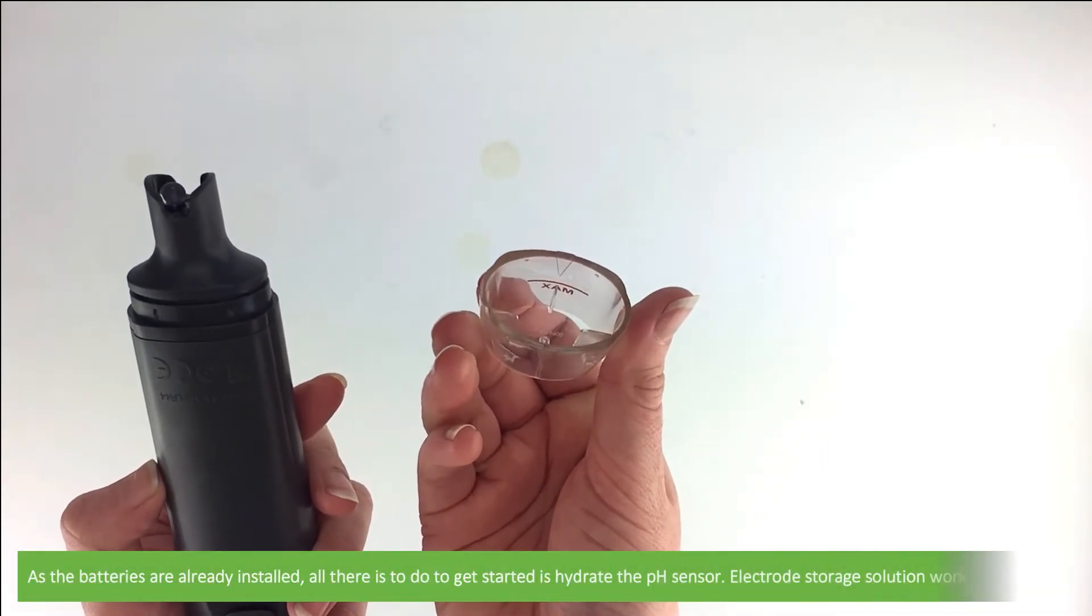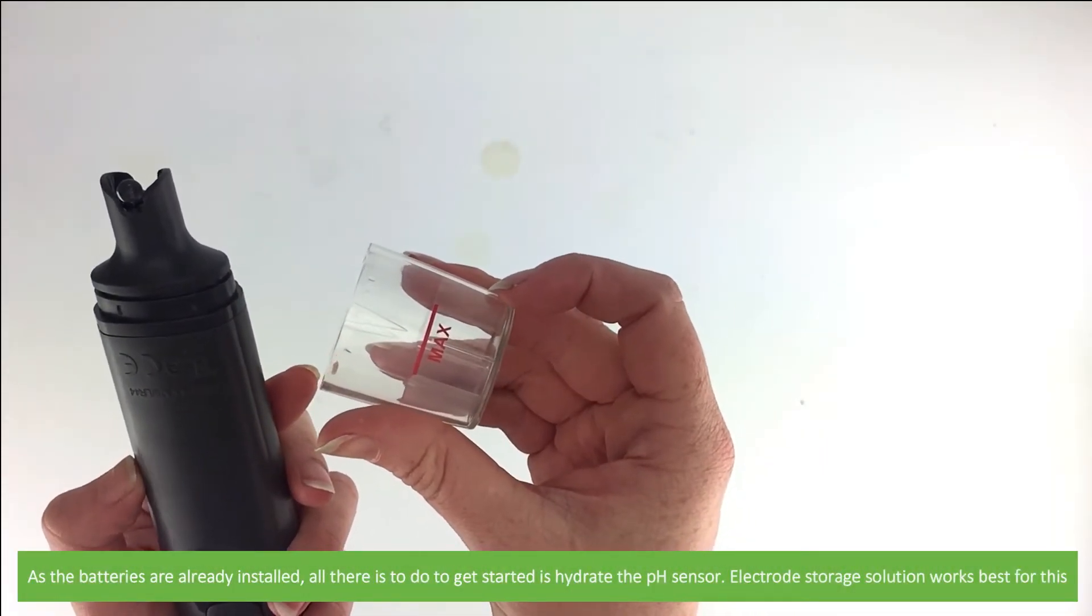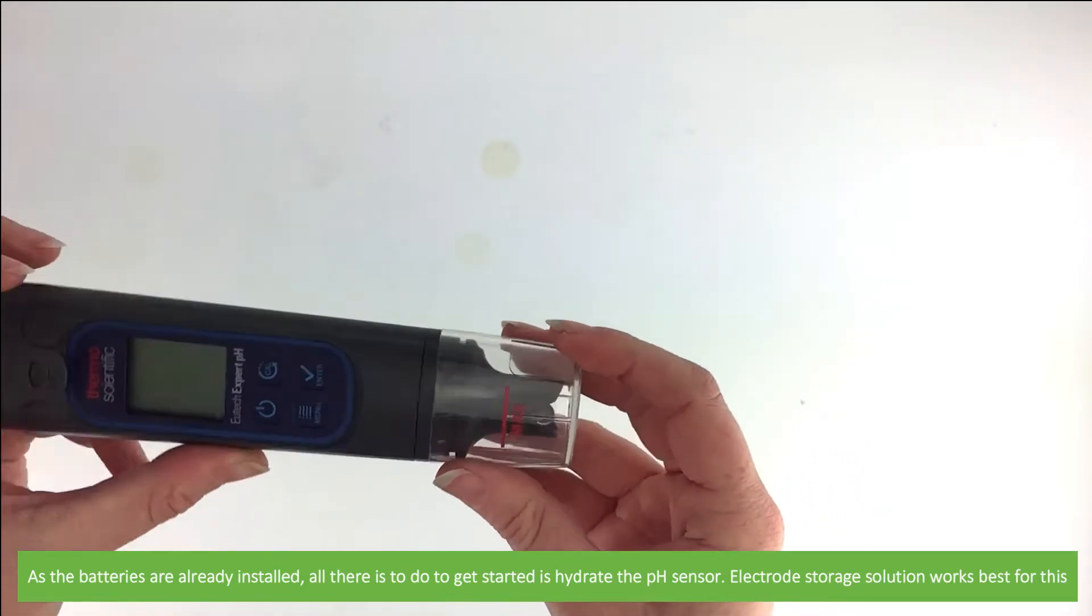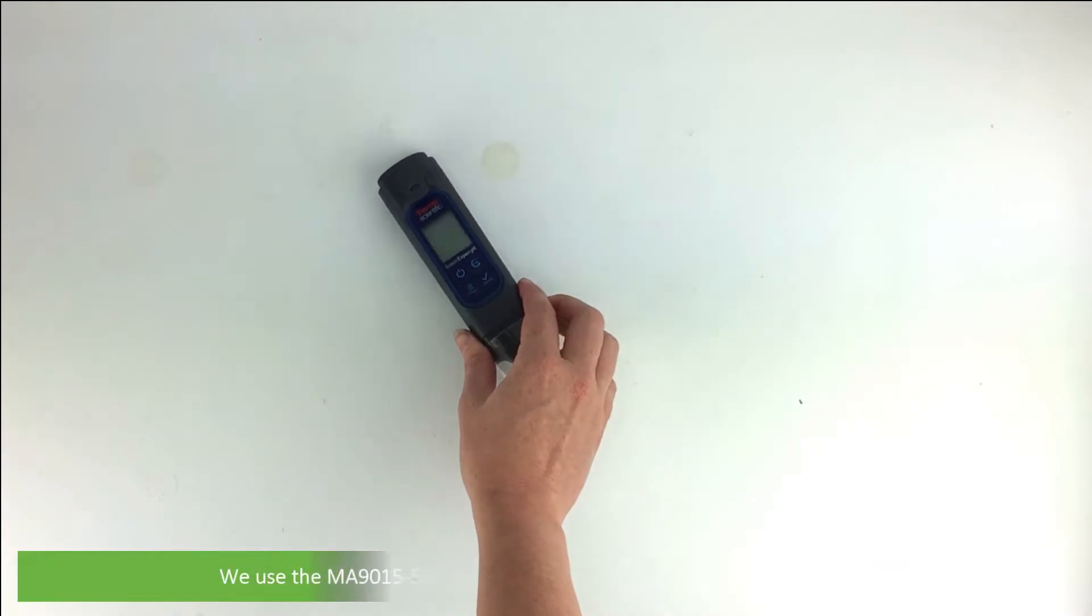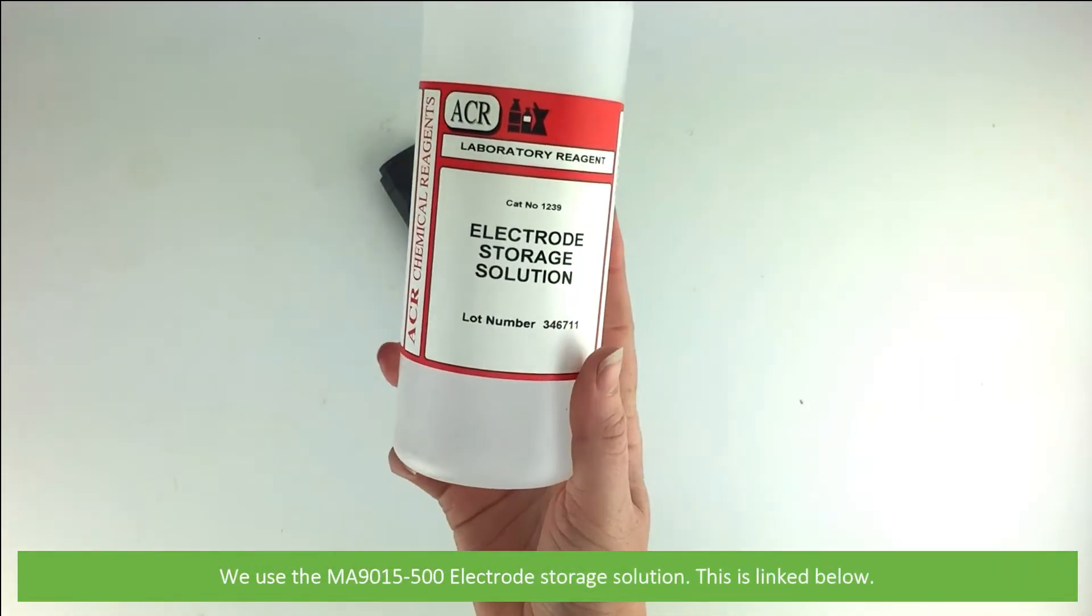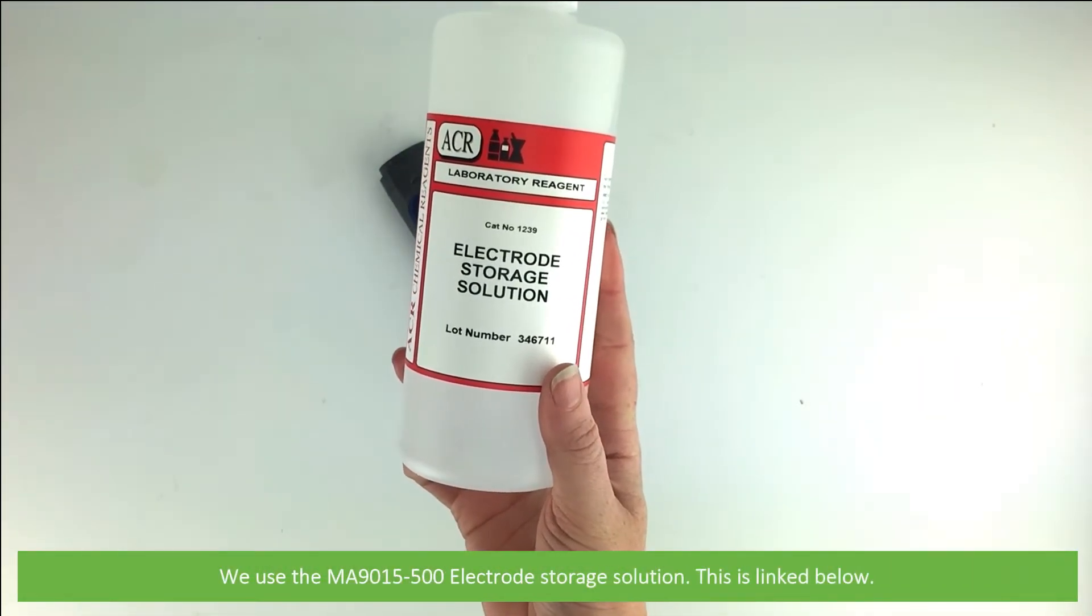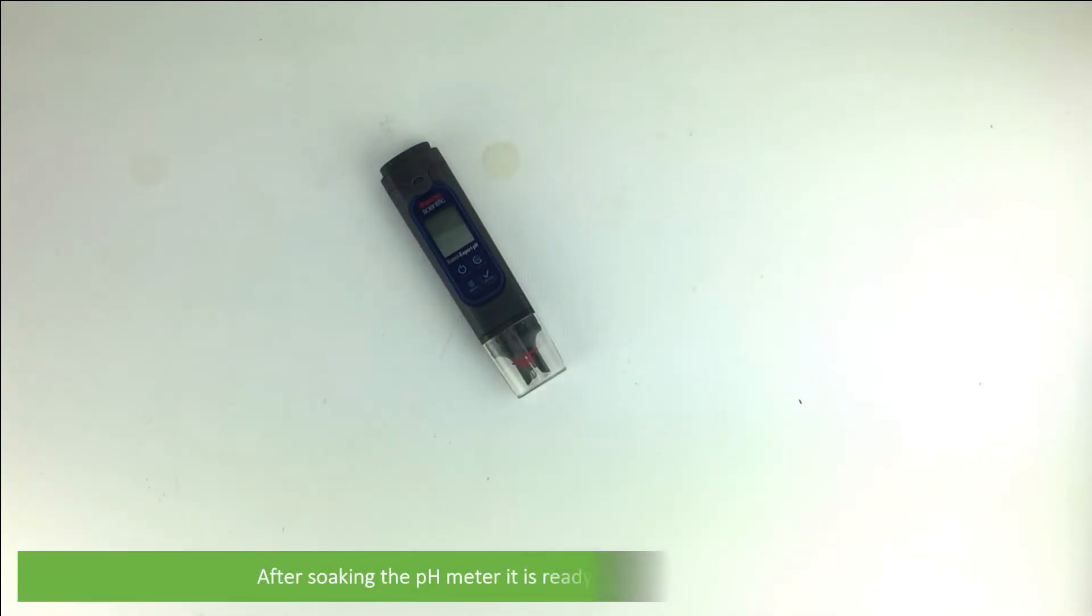As the batteries are already installed, all that's needed to get started is hydrate the pH sensor. Electrode storage solution works best for this. We use the MA9015-500 electrode storage solution. After soaking the pH meter, it is ready to be calibrated and used.